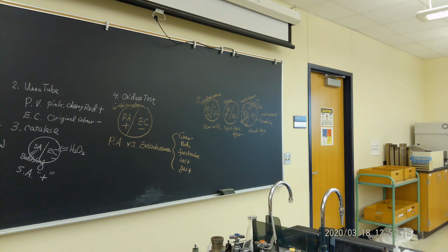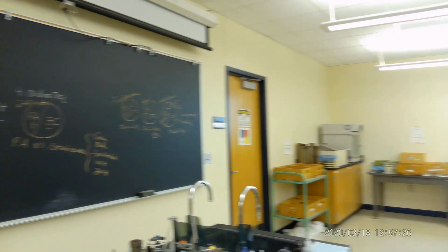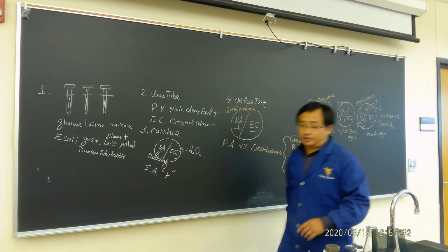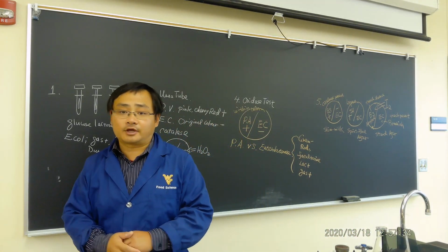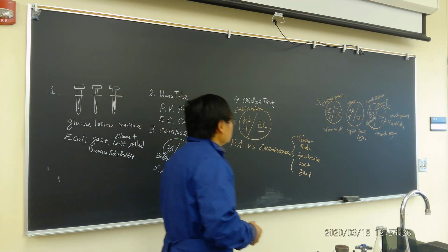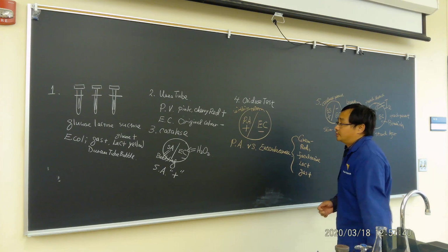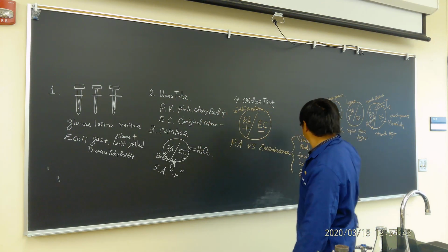It's been there a little bit of a while. Now the idea is that on this side you should leave a little bit of space, then we'll see the difference. Here we pretty much cannot see anything, but that's okay. That's also the result we talked about. So we talk about all these results. You're going to have to record it, typically the first couple ones.